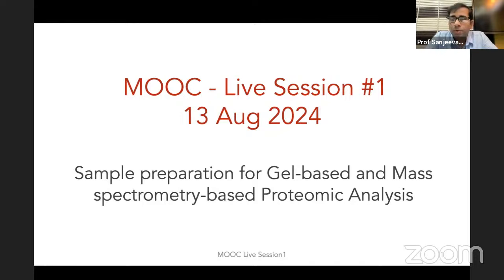I'm the instructor of your course on proteomics, gel-based proteomics, as well as the proteogenomics courses. Today, we thought to interact with you live. During this live session, we will also give you some of the experimental setup we have in our lab and how these kinds of experiments can be performed in the laboratory. Of course, you have been listening to our lectures, but today we thought to give you the feel of gel-based proteomics and mass spectrometry-based proteomic analysis.